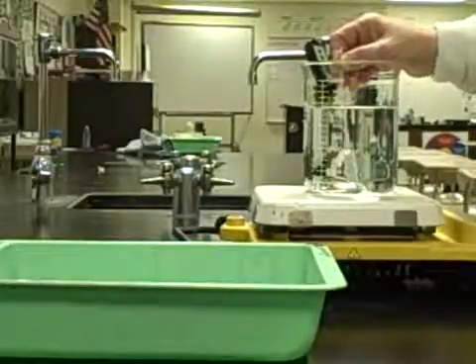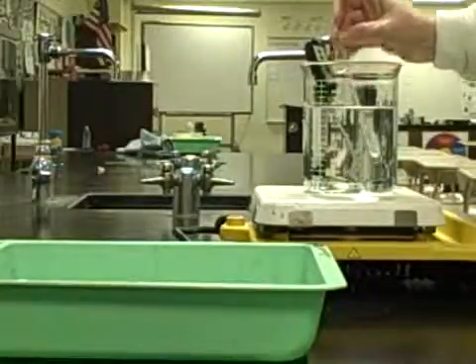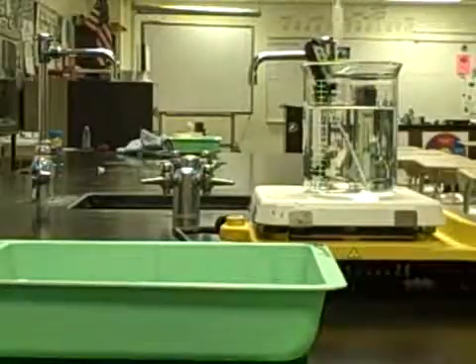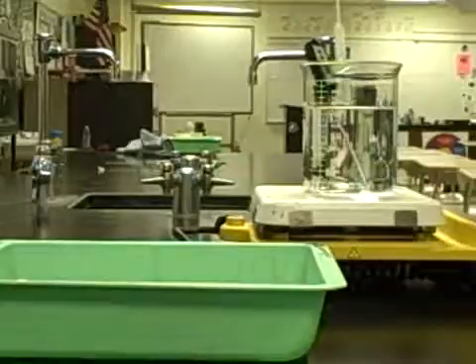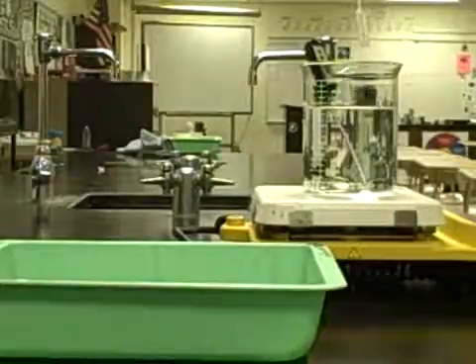Step 7 says seal the end of the pipette with your finger. So it's important you plug the end here before you pull it out, because as soon as you pull it out of this water bath, the gas in here is going to start cooling back down to room temperature. So we don't want any outside air to be drawn or pushed in here. So I'm going to seal it with my finger.